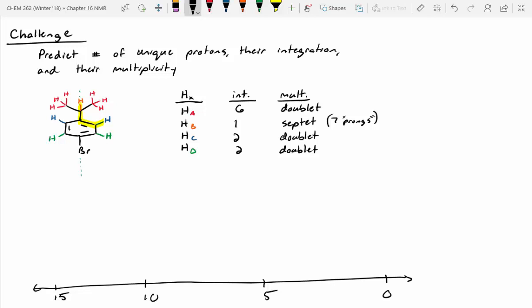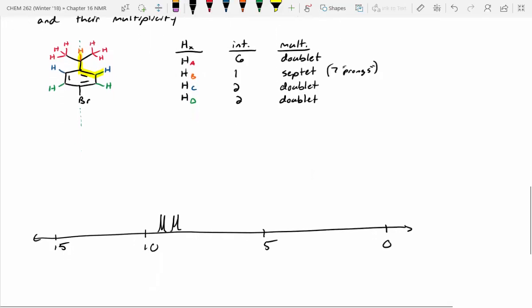All right, so protons coming off of an aromatic ring typically show up around 6 to 9 ppm. I'll give you guys a cheat sheet so that you can know where peaks show up. But we should have 2 doublets in that range, right? So what we can do is say, all right, 6 to 9 ppm, I'll have 1 doublet, and then maybe another doublet right next to it. Does that make sense? For each of those protons. It's really hard to tell which one is which, so arbitrarily I'm going to label one as HC and then the other as HD.